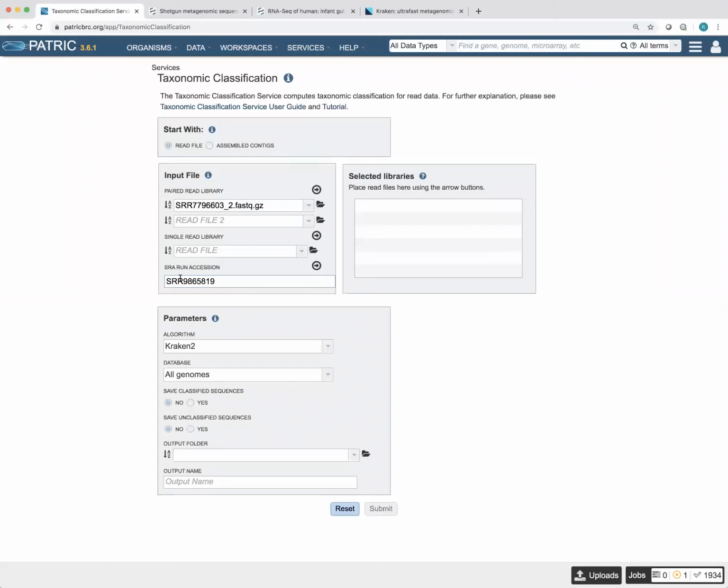And then once we've entered that, we've got to move the data to this box, because you could bring in a variety of data sets here. Let's say that you have a metagenomic sample from your sequencing center, and they tell you, oh, you know what, we ran 3 lanes for you in case one went bad, and actually all 3 of them worked.